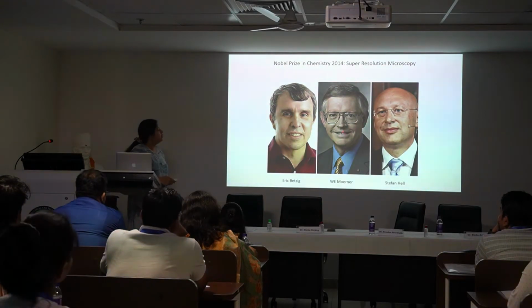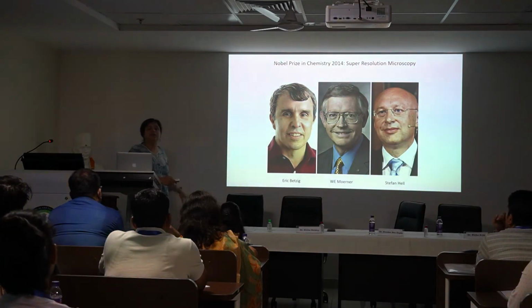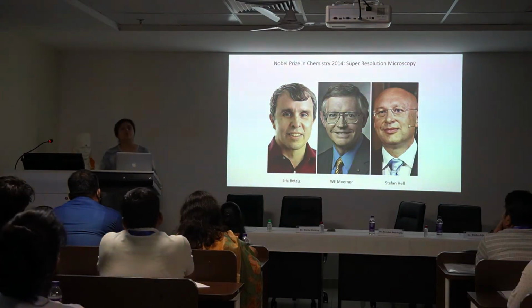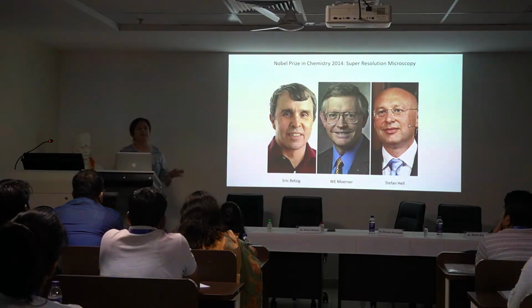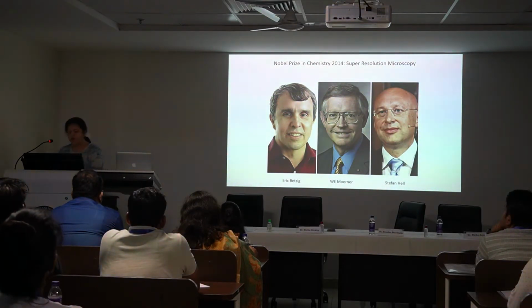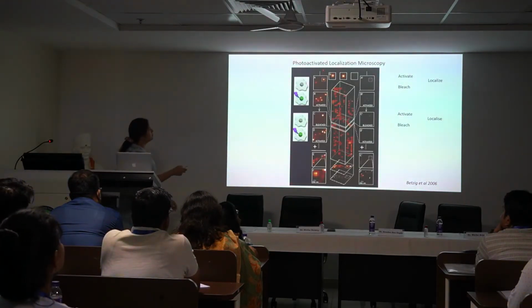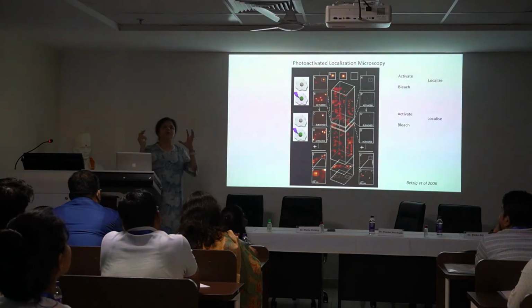And Moerner essentially looked at the physical principles of this even in the 80s. It was a really long time back when he said that this should be possible, and it can be possible in a variety of different ways. Betzig, who was working on this also for a long time, is the one that pioneered the PALM system, and I'll hopefully give you some flavor of how he came to it, right? So essentially, what is the PALM system? So this is photoactivated localization microscopy. So always try to contrast this to what you're going to see instead.